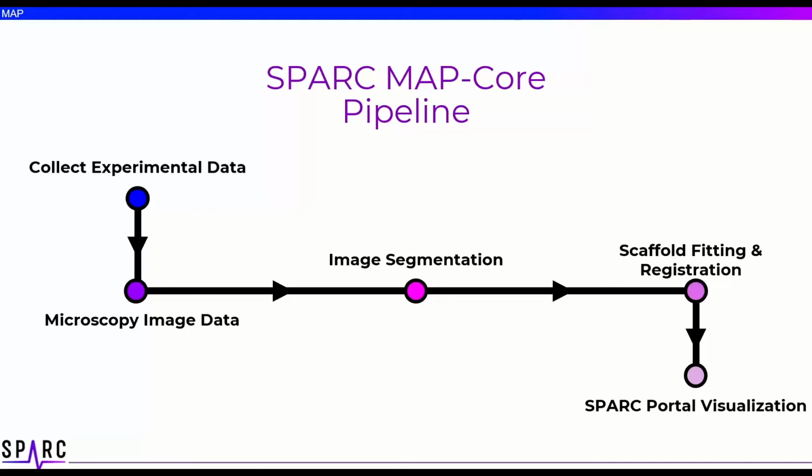Apart from image data, we also deal with non-image data such as RNAseq, electrophysiology measurements, motility, and pressure volume data. However, today we will be focusing on how image data is registered on scaffolds, and we will discuss how non-image data is handled in a future webinar.